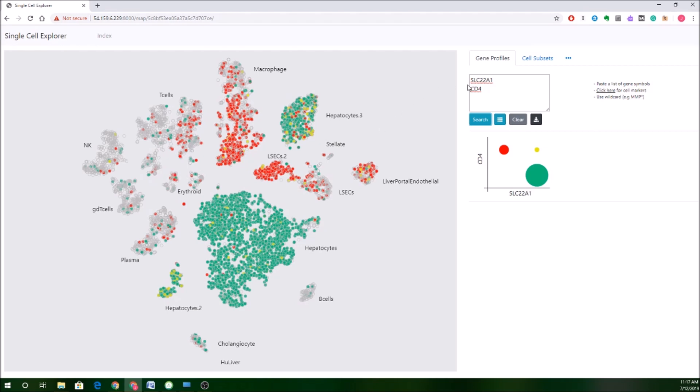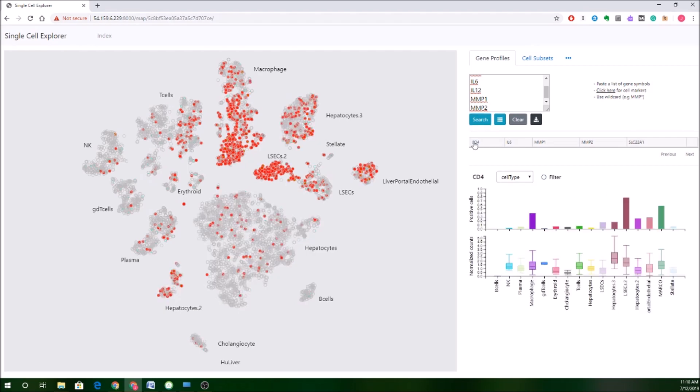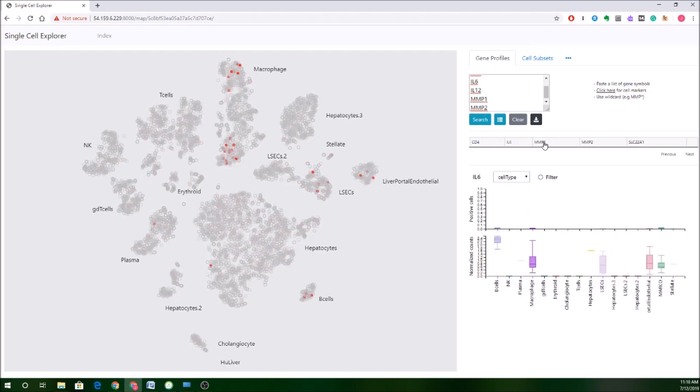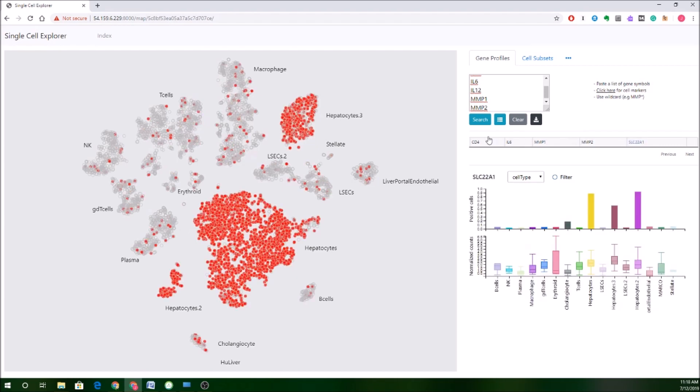Now, if I want to do a multi-gene query, I can actually keep adding additional markers. So say I want to punch in something like some interleukins. I'll go for IL-6, IL-12, maybe throw in an MMP or two, MMP1 and 2. Now, if I click search here, it's getting challenging for it to display that many categorical variables. So what you see instead is you'll see this table, which now will have one gene in this table. So I can now click through and very quickly, if I have a list of genes that I'd like to look through, I can quickly go from one to the next and see them all visualized on this map.